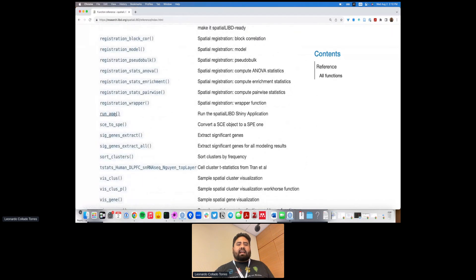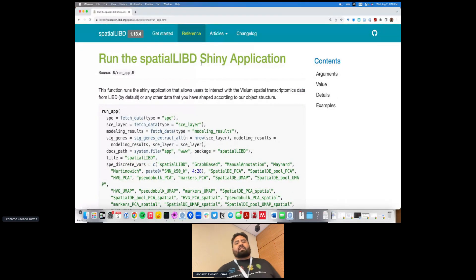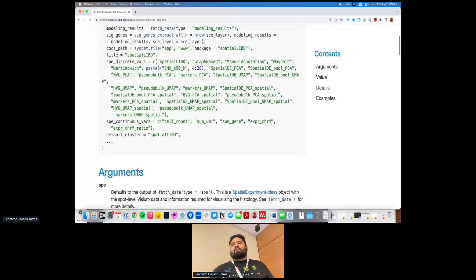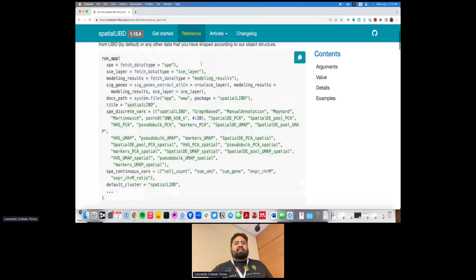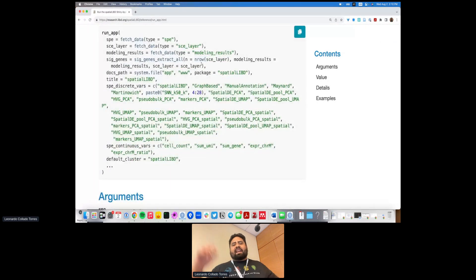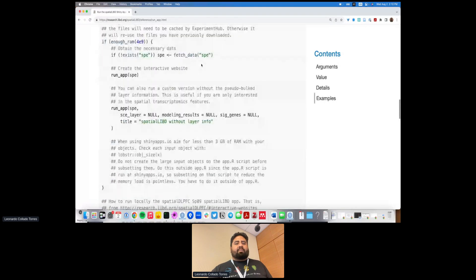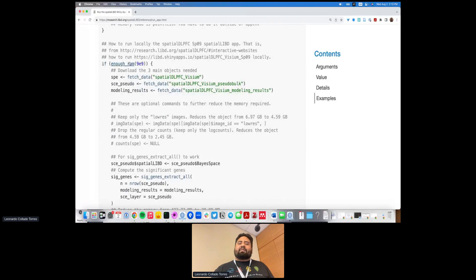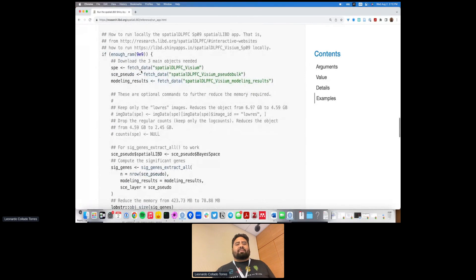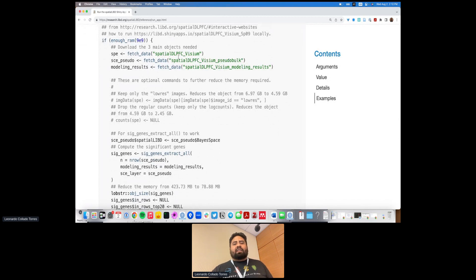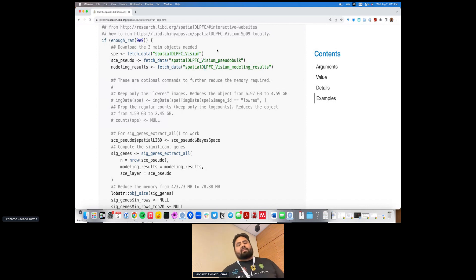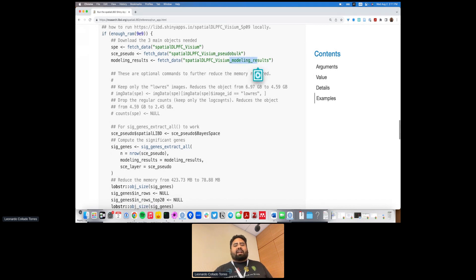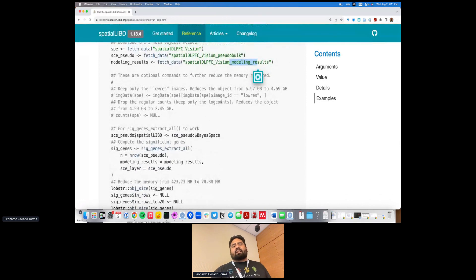There's one particular function I first wanted to demonstrate: the run_app function for making a Shiny application with spatialLIBD. This was the very first part of the package implemented, because when we first generated data we needed to manually label spots — that was the original purpose. It has been expanded since. In the examples, you download the spatialDLPFC Visium dataset as a SpatialExperiment object, the pseudobulk object, and the modeling results — then you're basically ready to make the Shiny app.